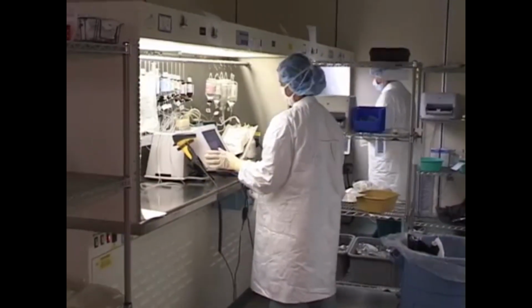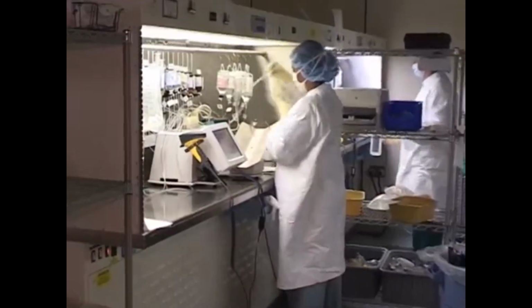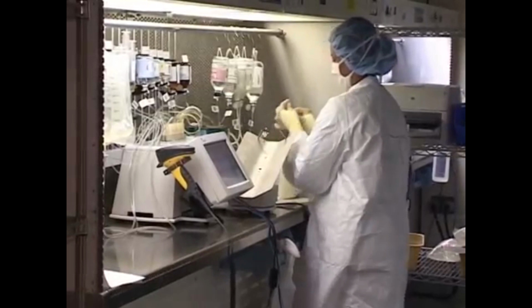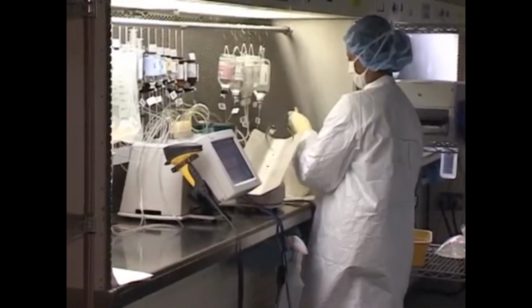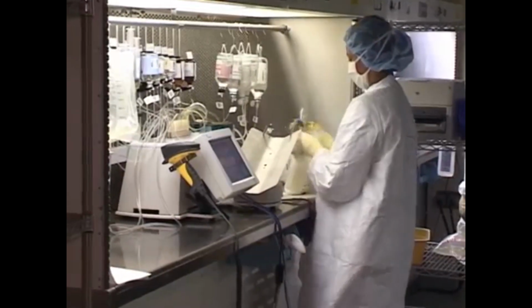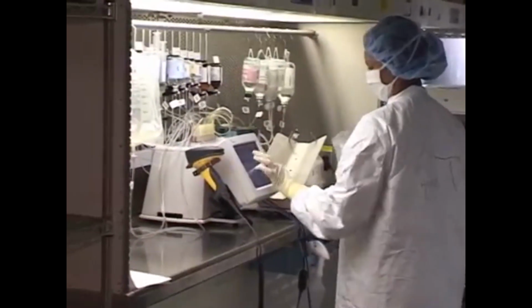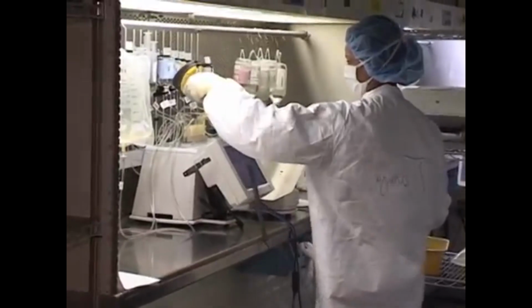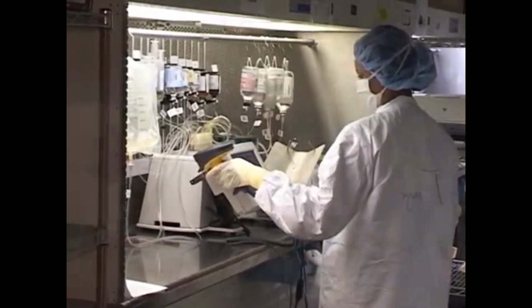The computer controls the system and offers many safeguards. It performs many of the calculations that would otherwise be prone to human error and alerts the user to potential entry errors and inappropriate orders. Alarms are available to detect free-flowing ingredients and air bubbles in the line. The final preparations are checked by comparing the anticipated final weight of the preparation against the actual final weight of the preparation. Variances of more than plus or minus 3% are not accepted.